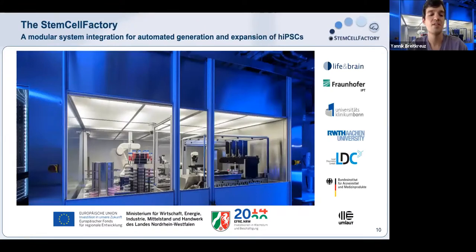Thanks, Bastian. So now let's go into the most interesting part of our talk, the presentation of our stem cell factory. The use of human-induced pluripotent stem cells offers fascinating perspectives for disease modeling, drug screening, and personalized therapy. The globally increasing demand for patient-derived iPS cells has created an urgent need for standardized and automated production processes. To that end, we developed the Stem Cell Factory, a modular platform for automated generation and expansion of human iPS cells.